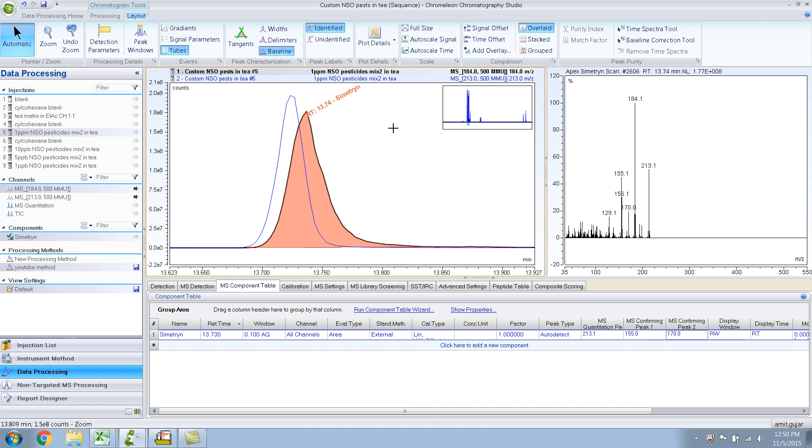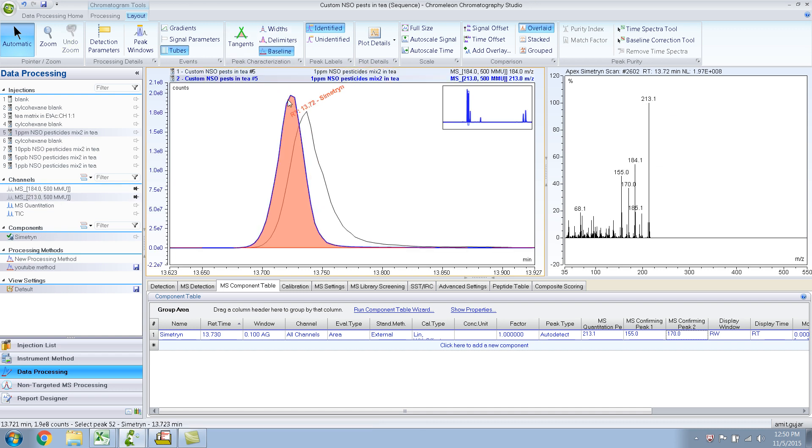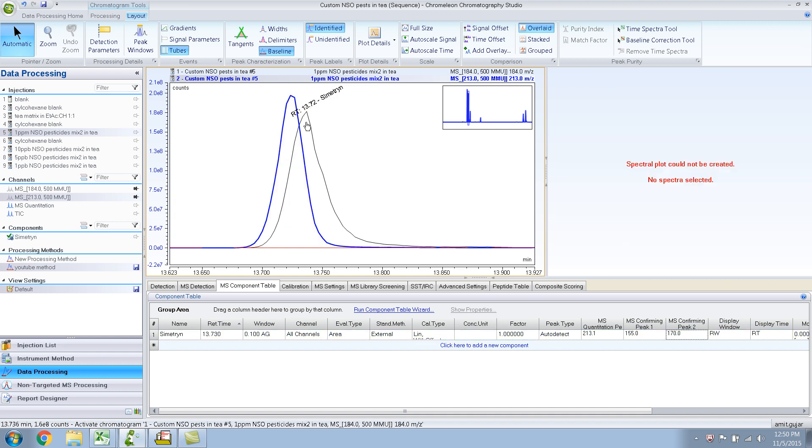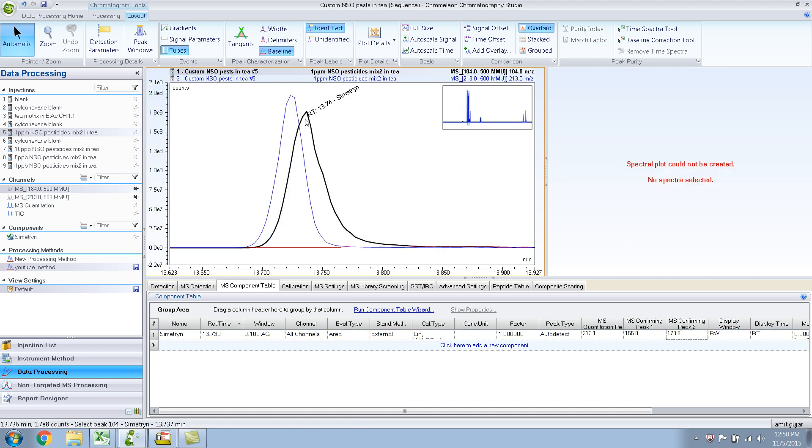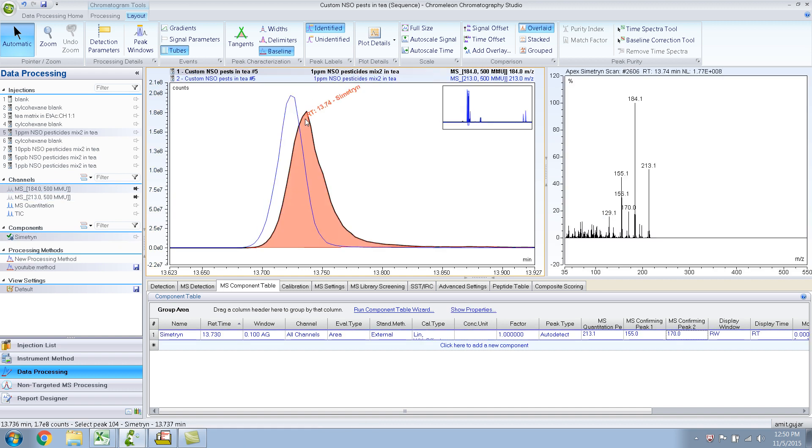Here it shows 184 as a base peak. If I click over here, 213 is the base peak. So this is the Simetryn and 184 is coming off this one, right?